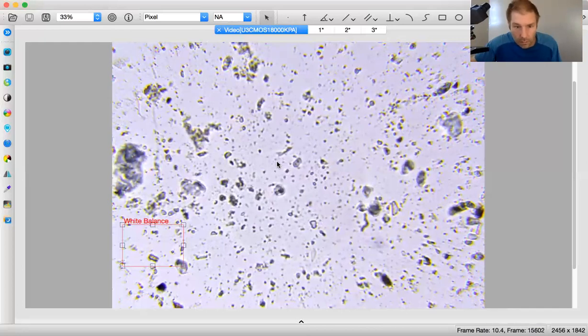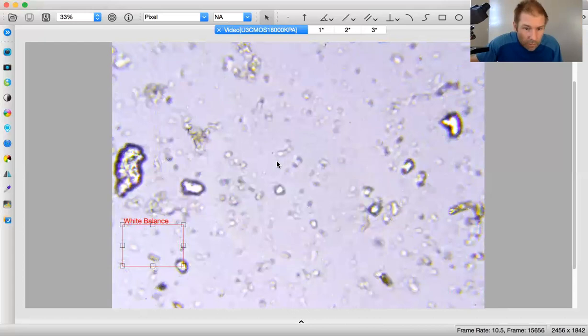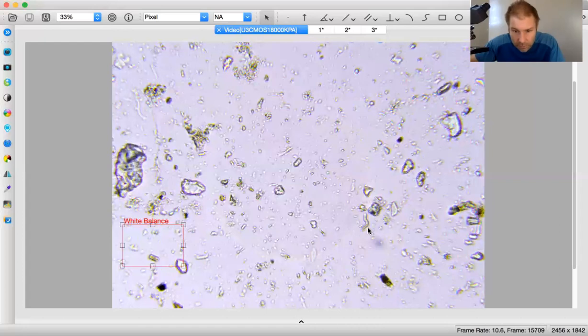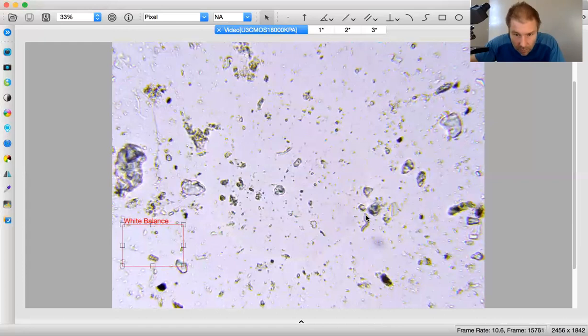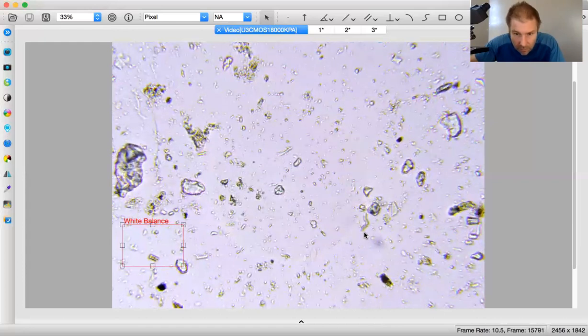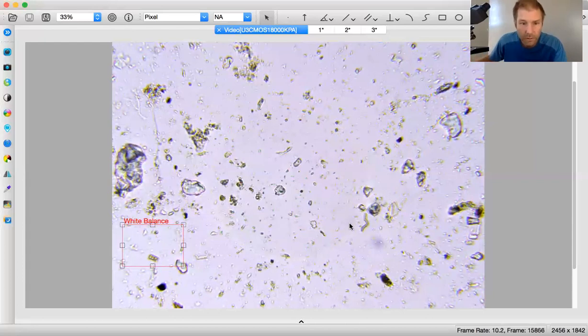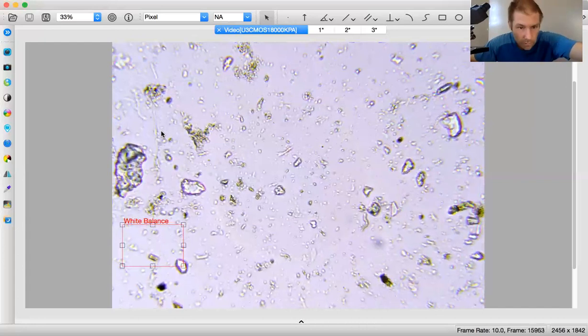What do we got? We have got beautiful actino. Ooh, beautiful. Looks like a little piece of the filament, that same fungi right here. It doesn't have good ends though. I'm not going to count that as filament because the ends are not broken smoothly and it's too small to see if they're brittle. So we do have some actino going on here though that is blatant. Here we are.